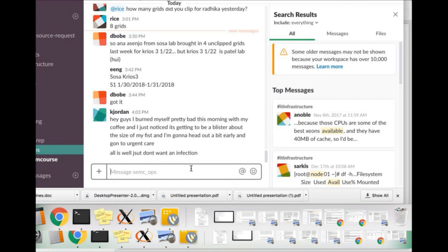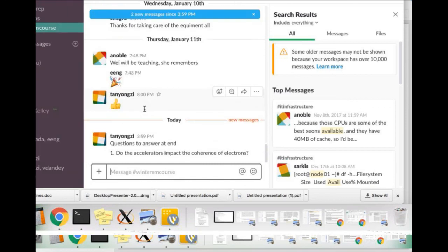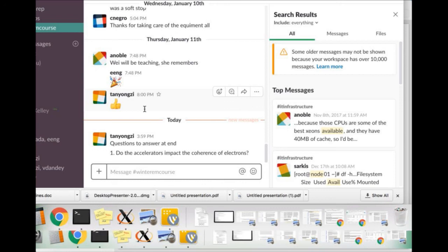Within a couple of years, you can have a petabyte of data, not just your raw data but what you process. In the EM field, you start to have to think in terms of petabytes. Terabytes are like nothing. You can collect a terabyte in a week, and several dozen terabytes, but then that becomes an issue. A lot of the concerns I'm highlighting are ancillary to the main point: yes, it can be done, but there are other seemingly unrelated reasons that make it harder.